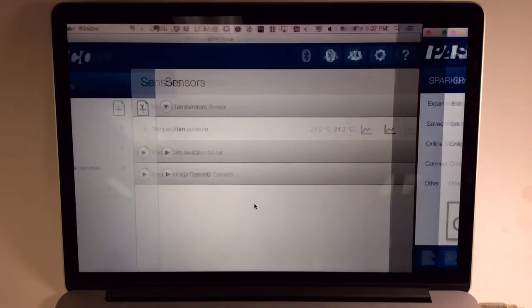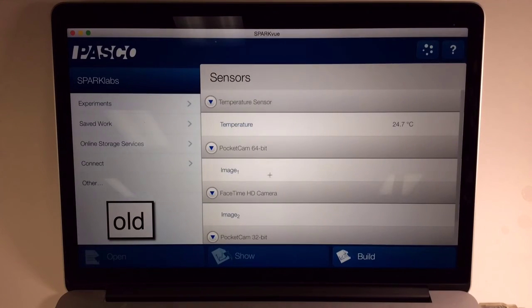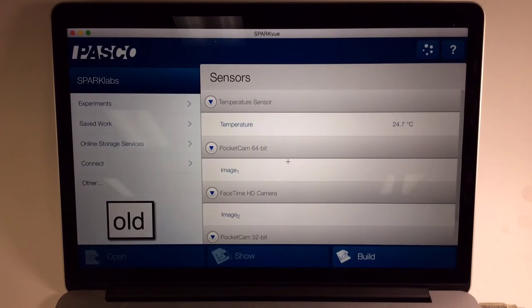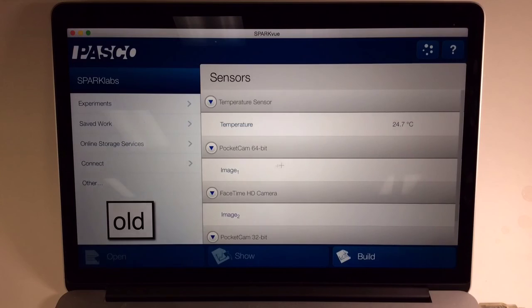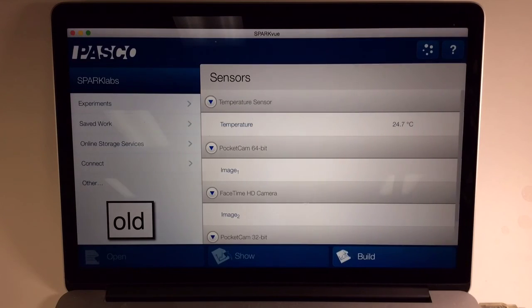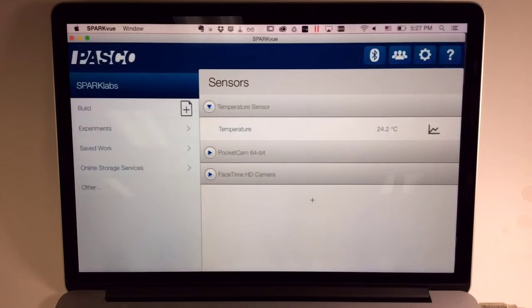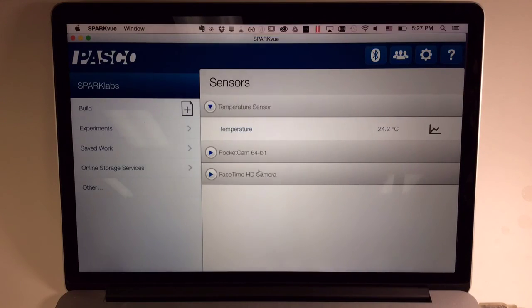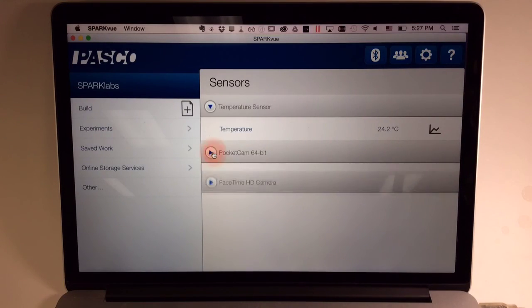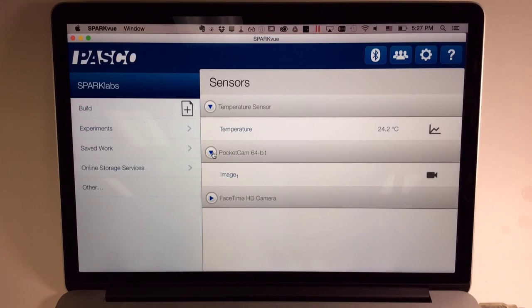Finally, you may notice that in the old SparkView home screen, built-in sensors on your computing device, including cameras, were shown open by default, and now they're a little less distracting as they are closed by default, but you can still open them.